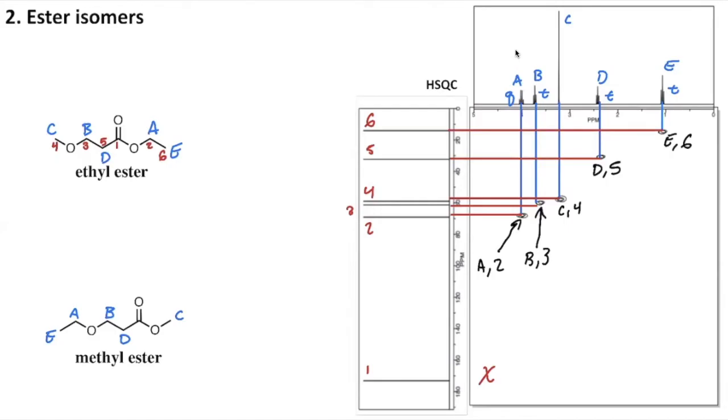So I'm going to replicate the same here, so that we have nice consistency between our two structures. And then I'm going to relabel all of the hydrogens as drawn out bonds to hydrogens so that we have an easier time visualizing it later on.